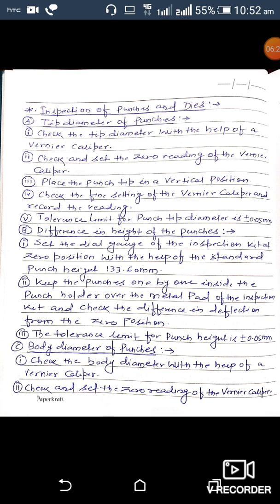To inspect the difference in height of the punches, set the dial gauge of the inspection kit at zero position using a standard punch height of 133.60 mm. Keep the punches one by one inside the punch holder over the metal pad of the inspection kit and check the difference in deflection from the zero position. The tolerance limit for punch height is plus or minus 0.05 mm.